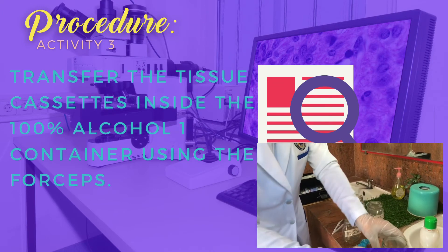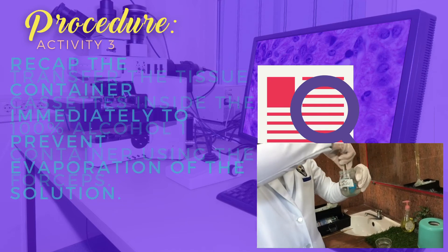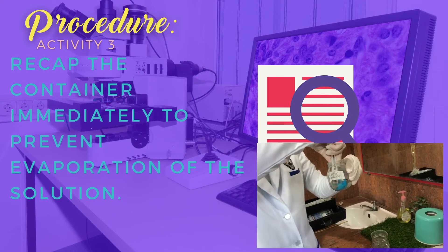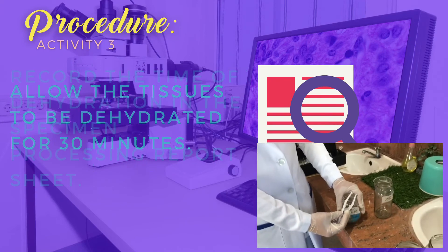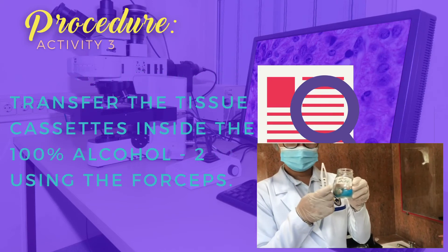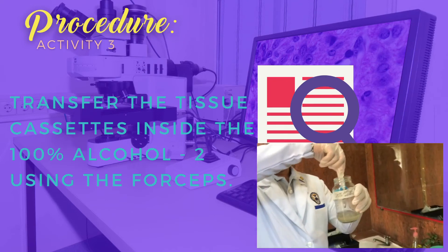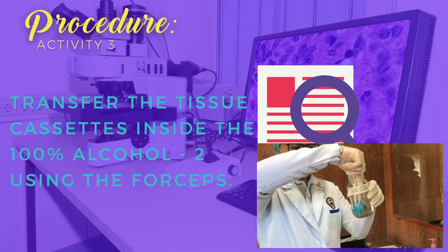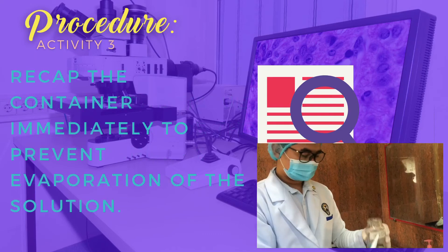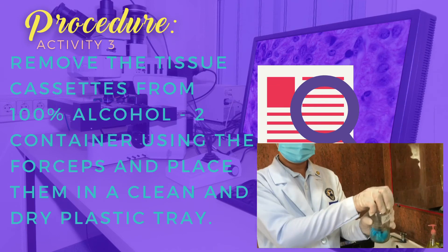Allow the tissue to be dehydrated again for 30 minutes. Transfer the tissue inside the 100% alcohol container 1, re-cap the container, and allow the tissue to be dehydrated once more for 30 minutes. Transfer the cassette into the next container and re-cap immediately. Allow the tissue to be dehydrated for 30 minutes.